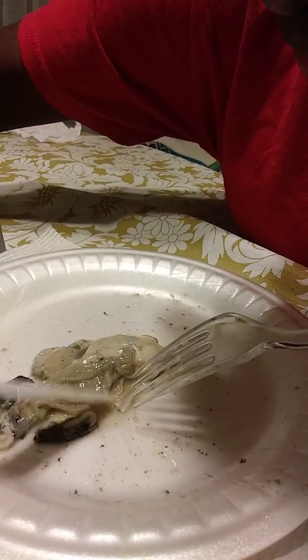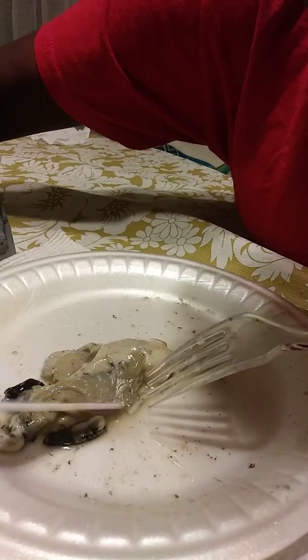Gill number 2 is kind of stuck to it. This is gill number 2. Gill number 3. And this is gill number 4 here. 4, 3, 2, and 1. 4 gills.